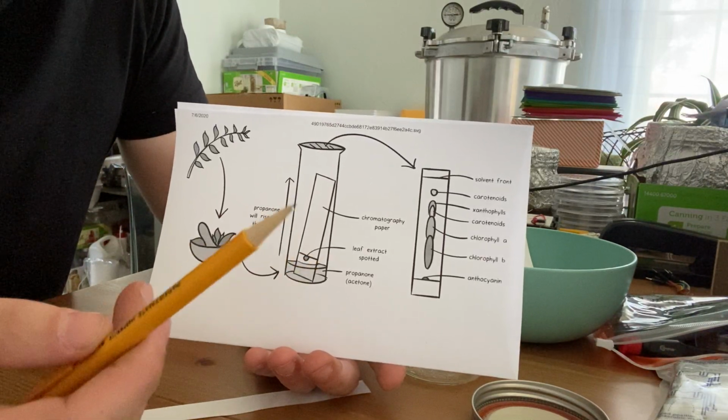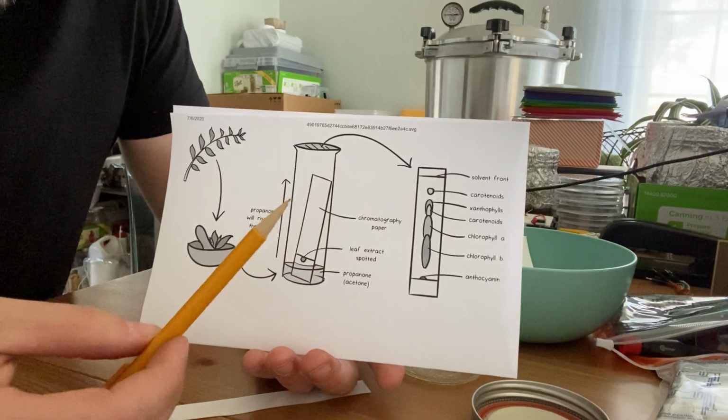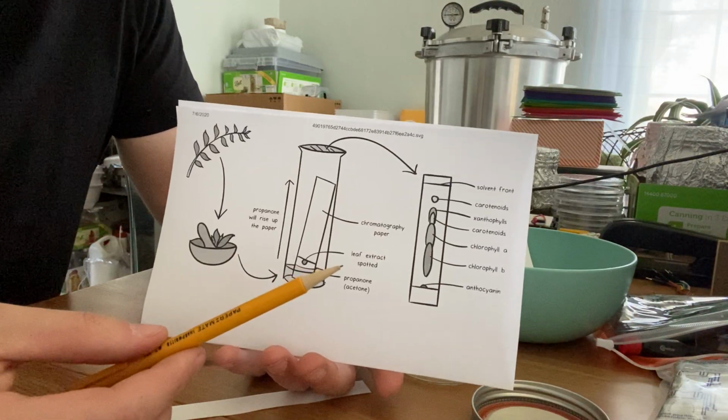Today I want to talk to you guys about a technique called thin layer chromatography. If we think about the word thin layer chromatography, chroma comes from the Greek word for color. Ography is sort of the field of study of something. So we know that it has something to do with color.